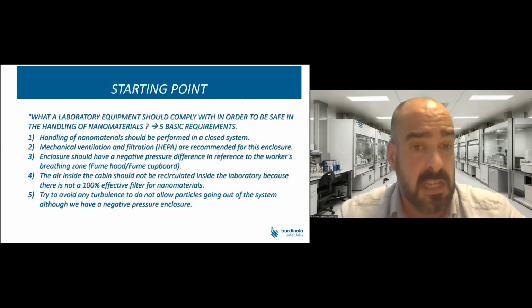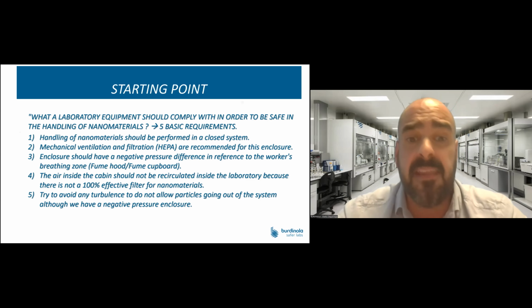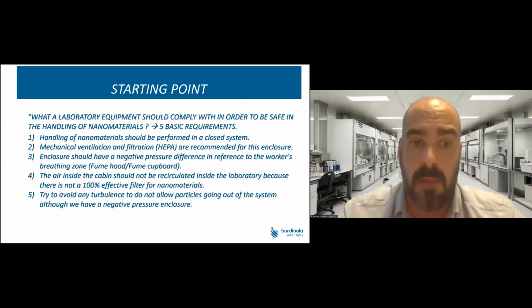So the first one is that handling of nanomaterials should be performed in a closed system. Mechanical ventilation and filtration are recommended for this enclosure in reference to the workers' breathing zone, so as not to pollute the environment.